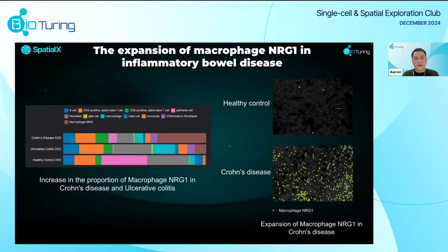The one that I just showed you before is that you can do cell type prediction at different levels. You can do it at the major cell type, and you can go down to the subcell type, and for that subcell type you can manually annotate into more subsets of the cell types of your interest. From that, I can get more detail about the cell type and the condition here as well.